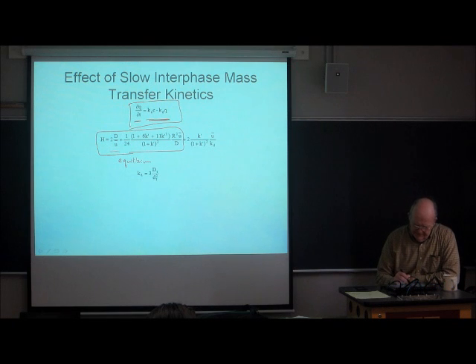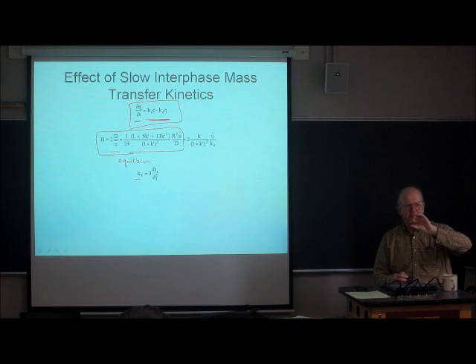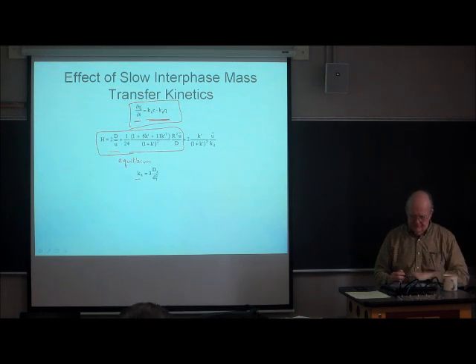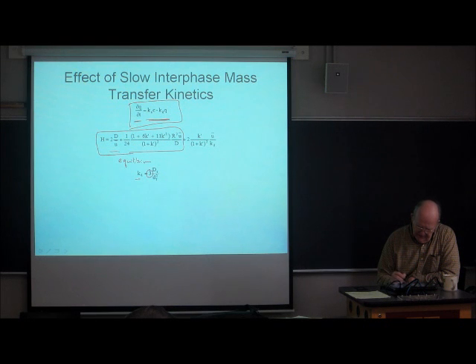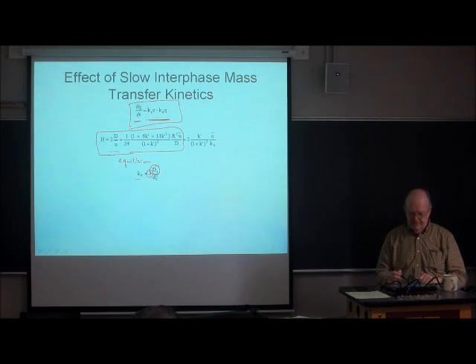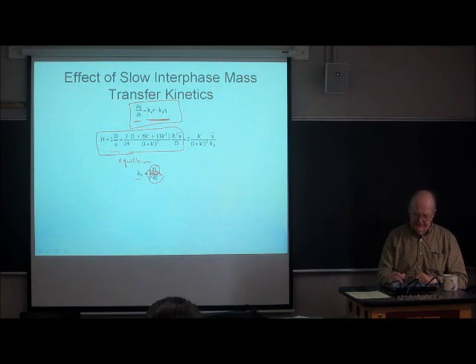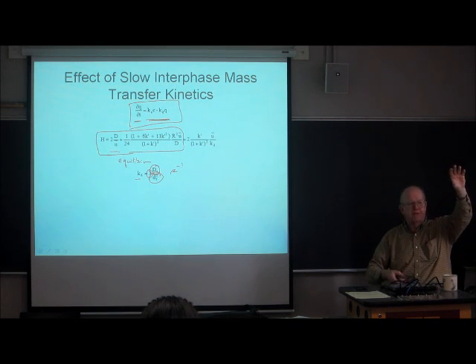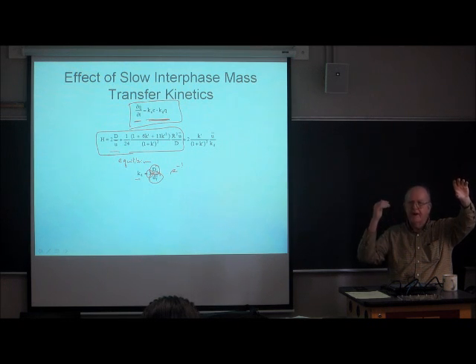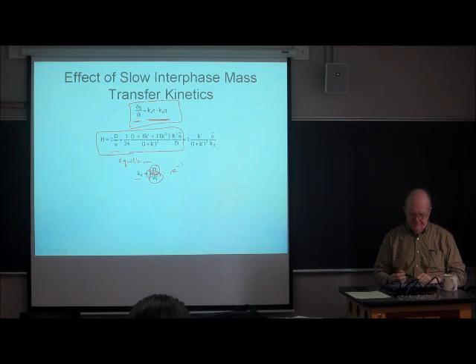we can calculate this rate constant from diffusion theory in a thin film. So we're going to just assume a flat, thin film. And that works out to be 3 times the diffusion coefficient of the solute in the stationary phase, divided by the square of the film thickness. So this Kd has units of seconds to the -1, because we have centimeters squared per second in the numerator, and centimeters squared in the denominator, so it's a seconds to the -1 rate constant.